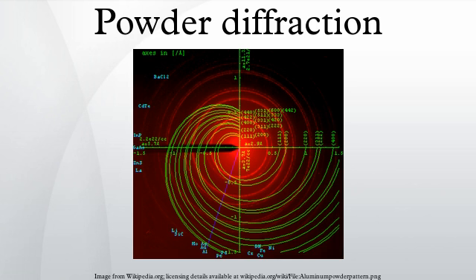Another configuration is the Bragg-Brentano θ-θ configuration, in which the sample is stationary while the X-ray tube and the detector are rotated around it. The angle formed between the tube and the detector is 2θ. This configuration is most convenient for loose powders. Position-sensitive and area detectors, which allow collection from multiple angles at once, are becoming more popular on currently supplied instrumentation.